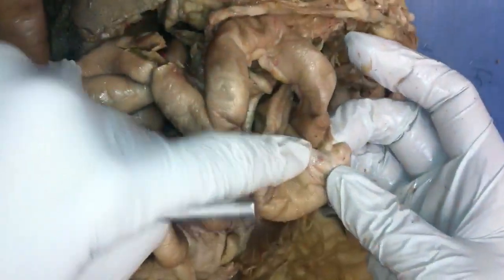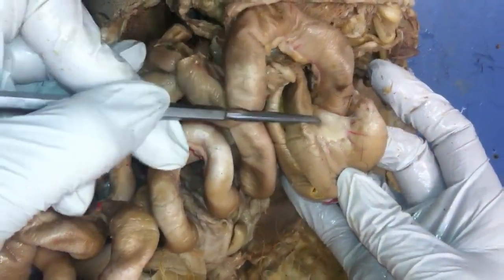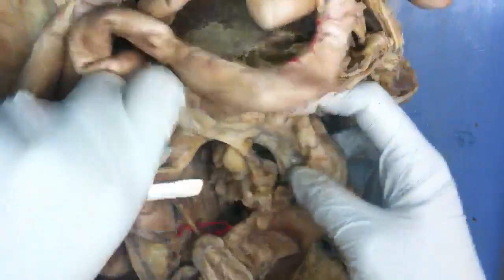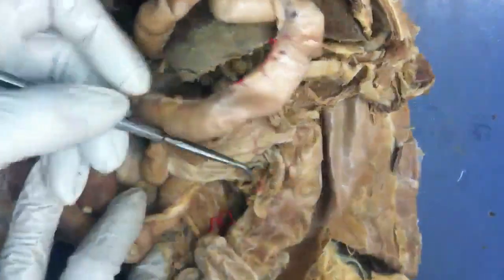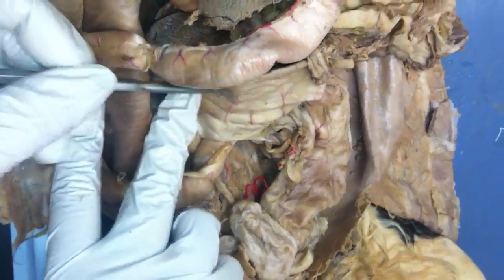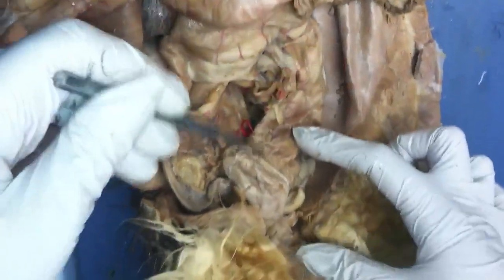and here it is. It's coming in here, and it goes from small to large. So this is the ileocecal valve. That's another sphincter. This little pouch is the cecum. And the way the intestine would sit, the way the colon would sit in the cat is kind of like a question mark. And so you'd have the cecum, then there's the ascending colon, which is this first part going up toward the head. The part that goes across is transverse, descending colon, and then rectum down here behind the bladder.